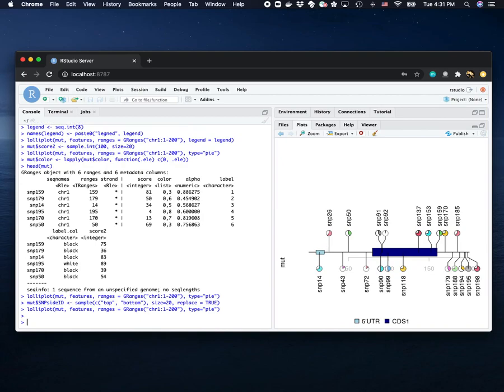The next step is we want to plot if we have more of them. For example, we have 50 of the mutations. We sample, for example, maximal 20. We get 40 of them.